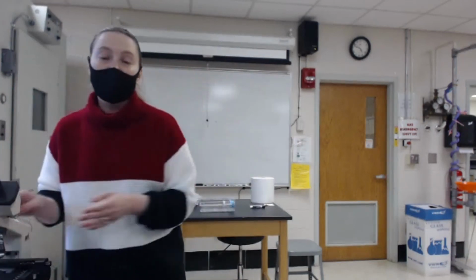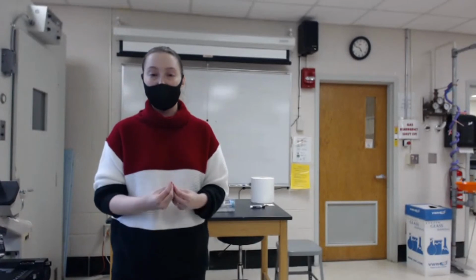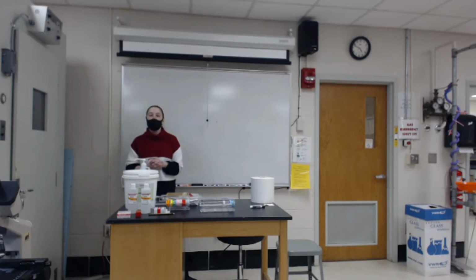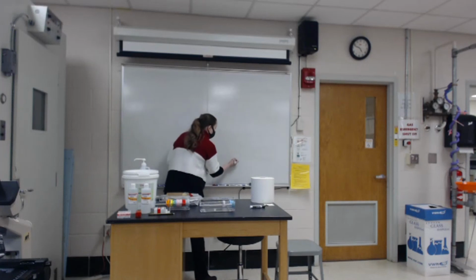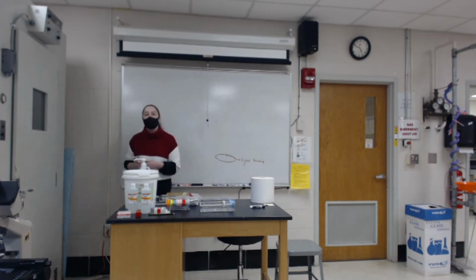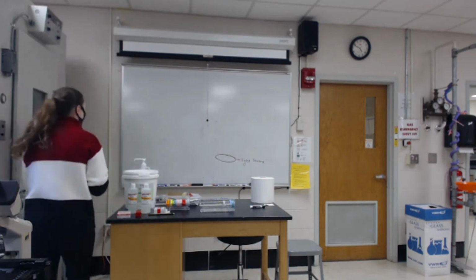I did want to talk a little bit about the lenses involved in the oil immersion lens, and how the use of oil contributes to this magnification and better resolution. On the board, I'm going to show some images, or try my best to illustrate the components of the microscope. At the base, we're going to have the light source, which has a light bulb. It's going to help us see the particular structures. Let me see if it's showing up on camera. A little bit, not perfect, but it's there.